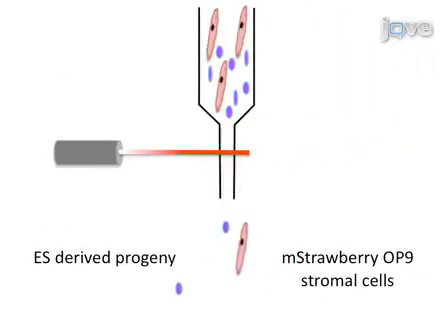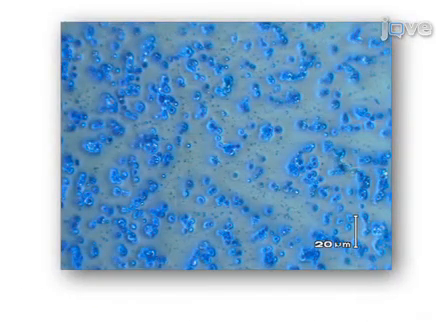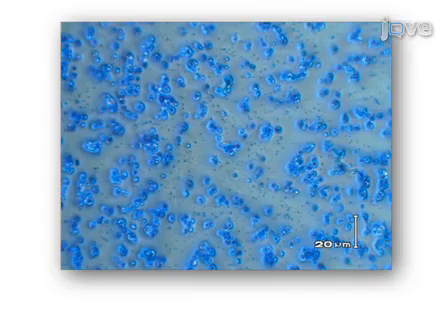At the appropriate harvest time, differentiated ES cell progeny can be separated from the M-strawberry OP9 stromal cell line by cell sorting. This ES differentiation protocol recapitulates primitive and definitive hematopoiesis as observed in vivo and can be used to characterize hematopoietic defects associated with knockout ES cell lines without the use of embryos.